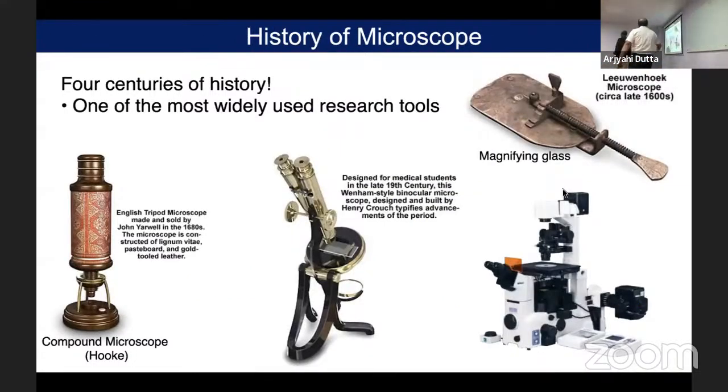This is the history of the microscope in short. In this short time, I cannot explain how the microscope developed from one stage to another, but we should remember that Galileo in 1609 first developed the microscopy thing. There is a tunnel, and they put some kind of glass lenses and try to see the planets, stars, moving objects like that. That was the first microscope we have.